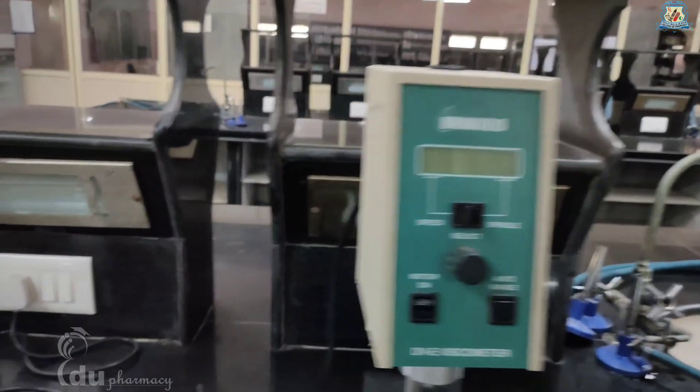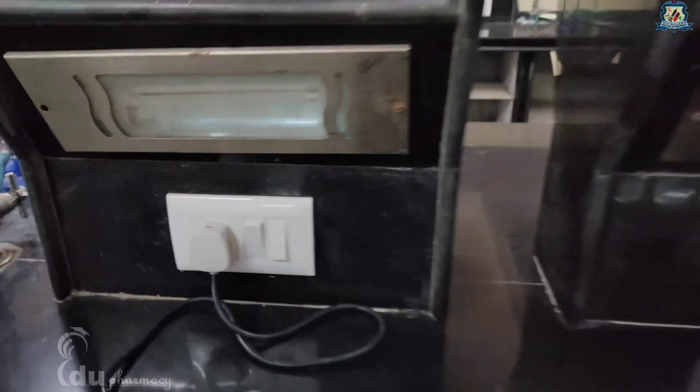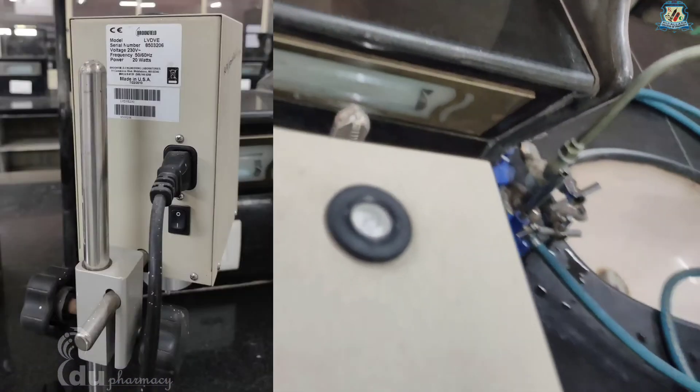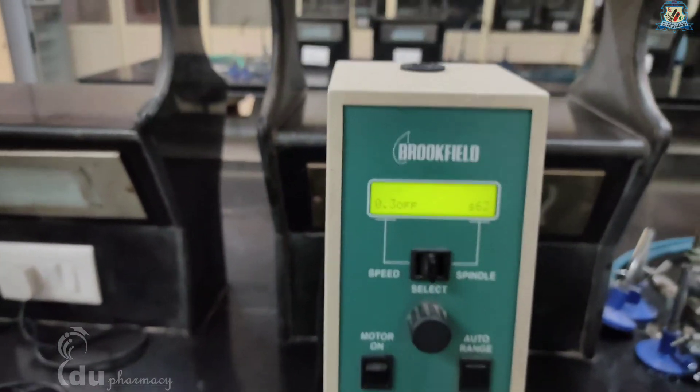Now you are ready to power up the instrument. Switch on the main power supply and turn the power switch located on the rear panel to the on position. This will result in the screen displaying the startup screen.